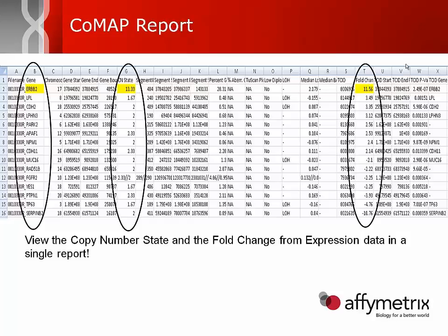And I am exporting an AED file out of TAC, which holds the fold change information for each transcript ID. Transcript ID is going to be similar to the gene. It's the Affymetrix expression ID that roughly, for our purposes here in this brief description, is sort of equating to the gene.